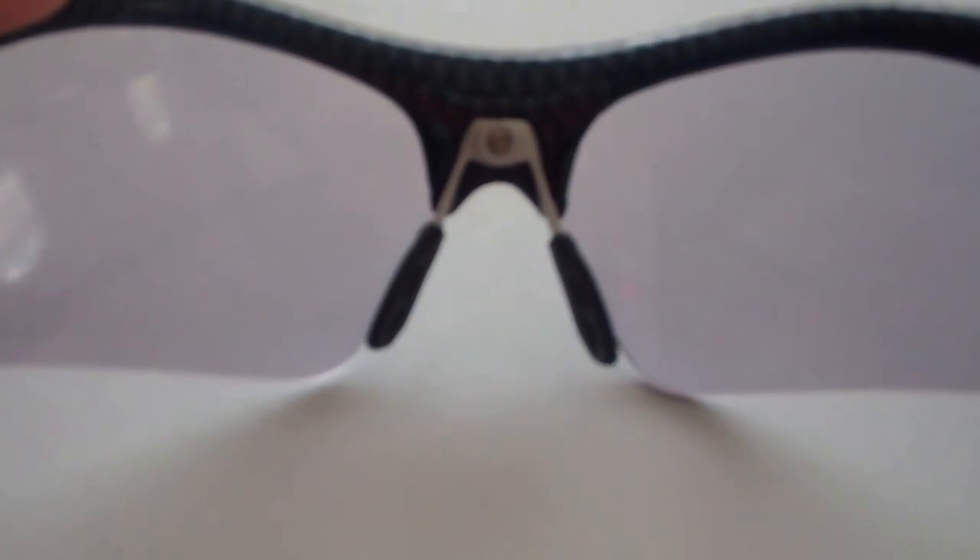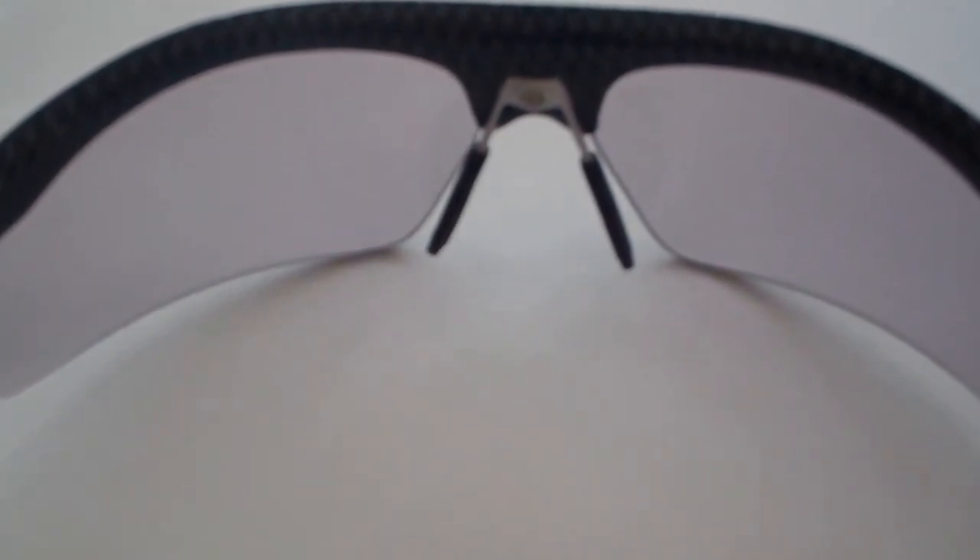What I really like about these Smart Lenses from 3M is that they're very, very comfortable. They're extremely light, they fit well, and I've actually got a pretty big head — they fit my head very well. The nose piece feels more like high-end sunglasses and less like safety glasses. That's always been one of my complaints about safety glasses: you know you have them on and they're annoying. These feel very nice on your head and you almost forget you're wearing them. The 3M photochromic lenses are definitely worth consideration for anyone transitioning inside and outside, doing yard work, and wanting to protect their eyes.